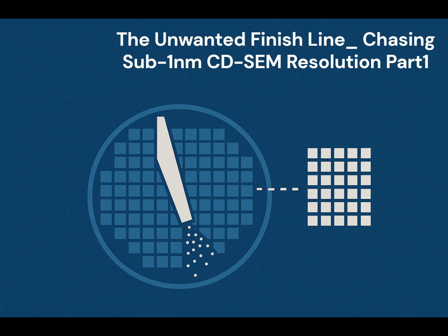Today, I'm kicking off a short series on SEM resolution with what might sound like a slightly dramatic title: The Unwanted Finish Line, Chasing Sub 1 NM Resolution. Why this topic? Well, mostly because of the persistent misconceptions that seem to pop up in marketing slides and technical talks about the so-called next steps in SEM development.